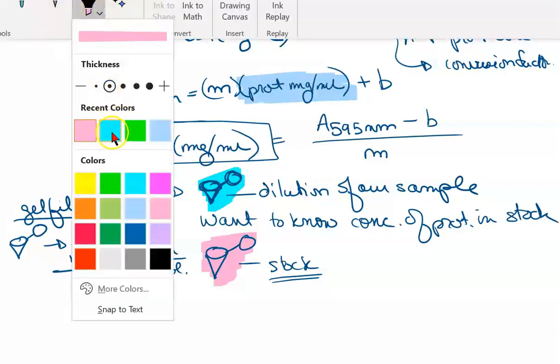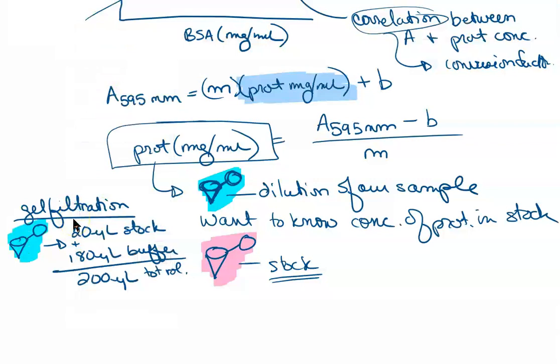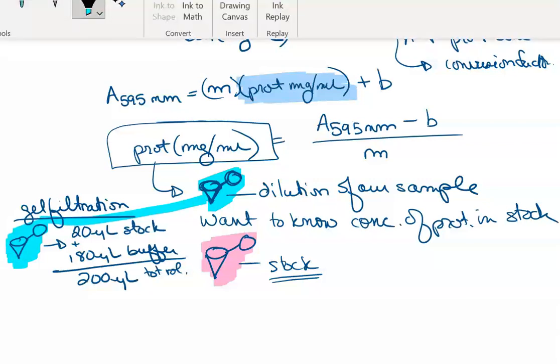That's what we added, 20 microliters of this. We know the protein concentration is that, and we want to figure out what is the concentration.